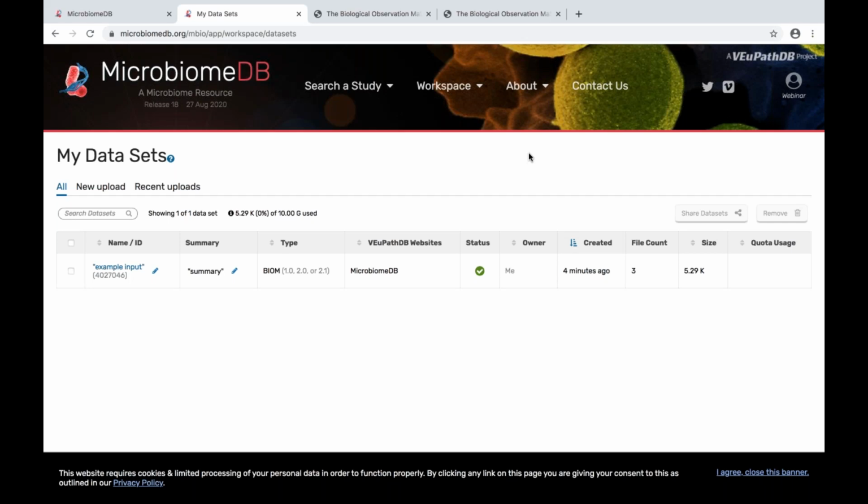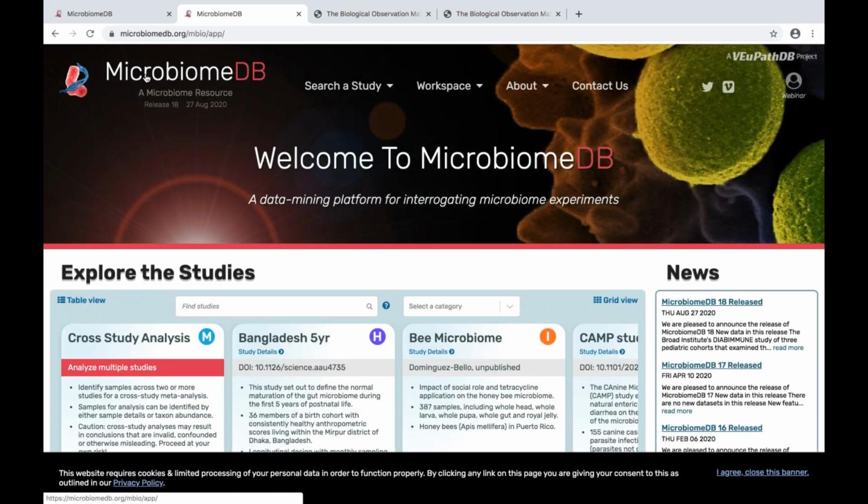Sorry, Dan, go ahead. No, I was just going to mention, following up on that, there's no reason why you couldn't use this direct upload to look at data from a shotgun metagenomic study. We don't currently load shotgun metagenomic data, but if you have processed it and have it in a biome file, then that taxonomic information would be presumably easily accessible as a direct upload, and then examining it through the apps.